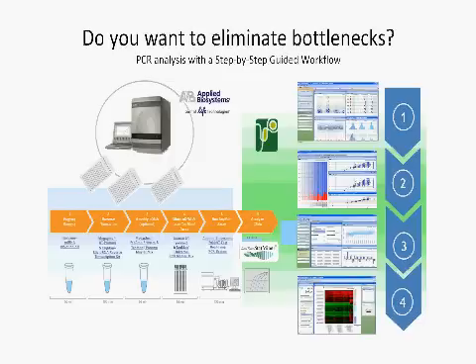So, what we did was we developed a similar protocol to that of the experiment, but this time for the analysis. So, there is a step-by-step guided workflow starting from importing their data, importing the experimental design, going through quality control steps, and then finally normalizing and performing differential expression and generating a report fairly easily and fairly quickly.